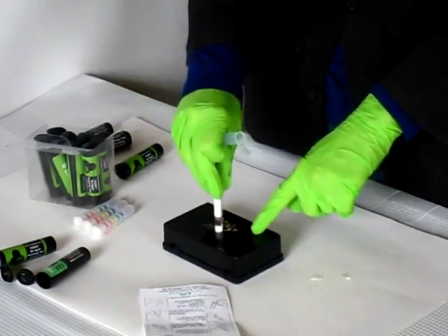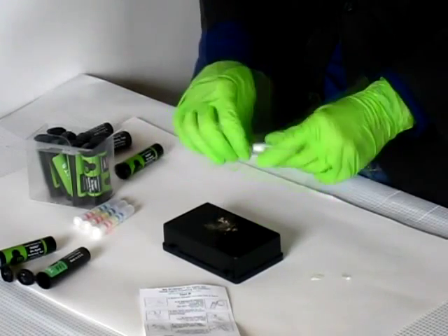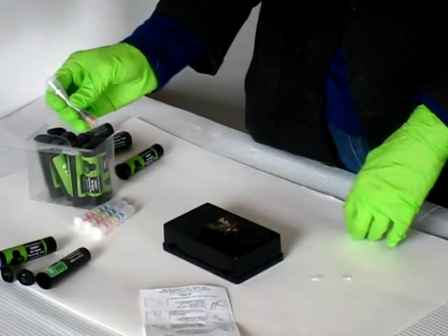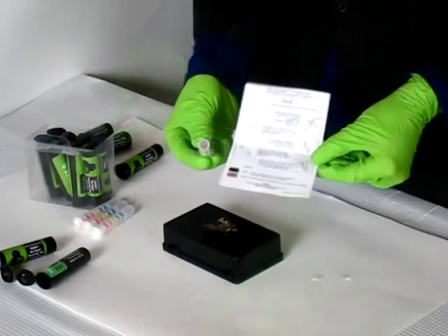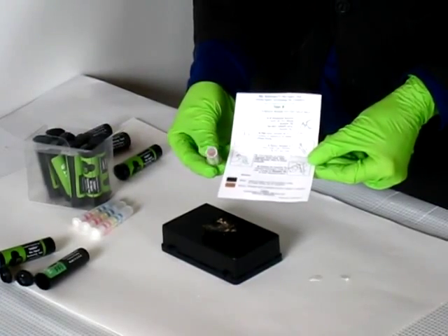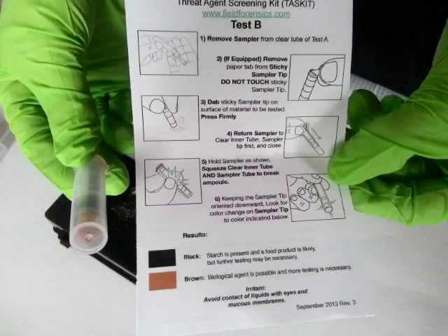Black is positive for Starch. The lack of Starch is a strong indicator for a biological agent. Here the test is brown, or negative for Starch, and further testing is necessary.